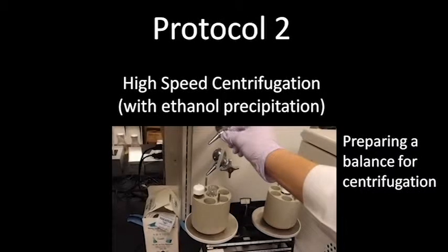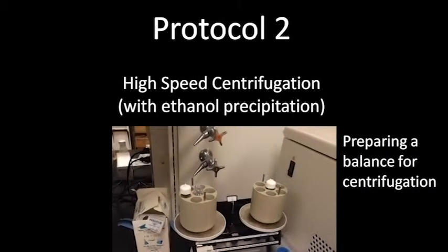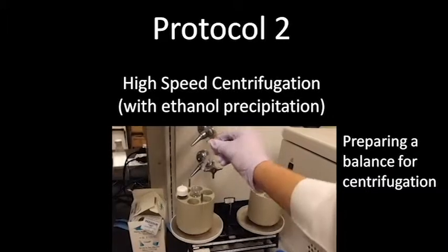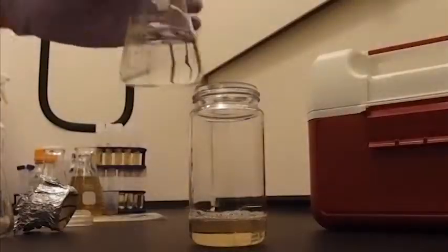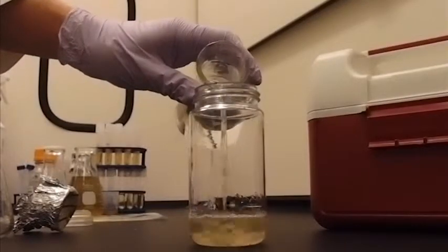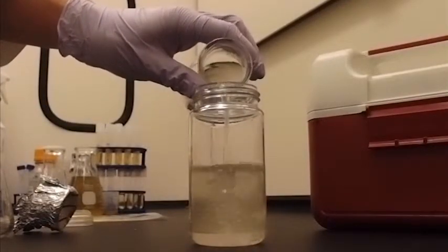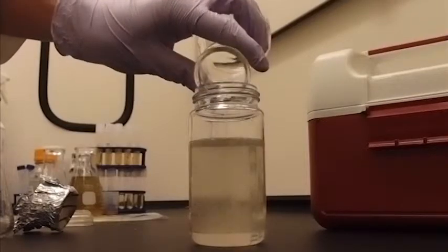The second protocol begins with high-speed centrifugation, which produces a force of 30,000 G. The bulk force detaches the PIA from the cells and it goes into solution. To remove some of the impurities, the sample is precipitated with ethanol. Adding ethanol and letting it sit overnight causes the PIA to become solid.